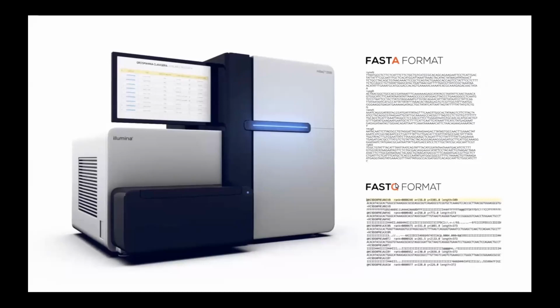Q stands for quality. We also collect information that was assembled from these short reads in files that are FASTA format. So for example, the human genome would be in the FASTA format. This is the same type of format where you can see individual letters of the code, but they don't contain the quality.